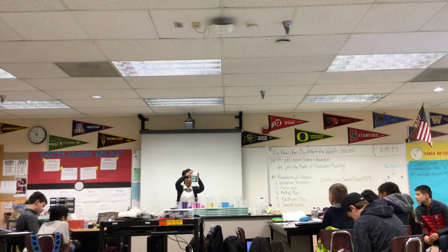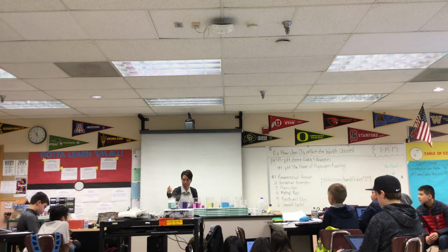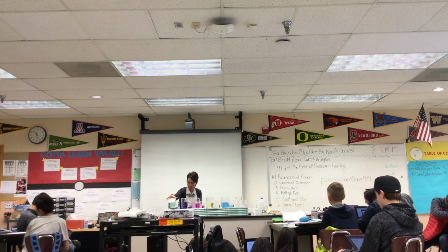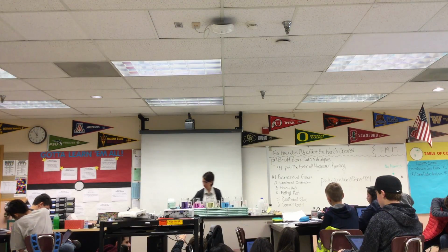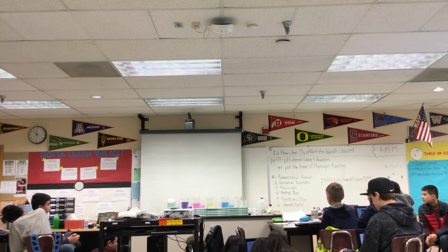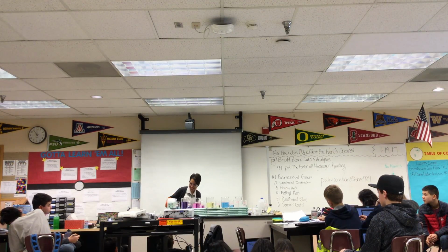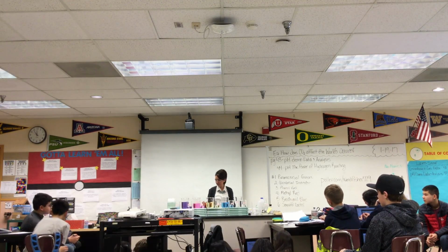All right, so we're gonna let this one go for just a second, and I may have to add in a little bit more dry ice. So we'll let that one go. The vapor is really cool. Like it's cool to the touch. If you want to add that the beaker gets cold, right? Cold during the reaction. Let that go. Is it turning? Slowly. Just add another one in there for good measure. All right. Just throw some more in. Throw some more.